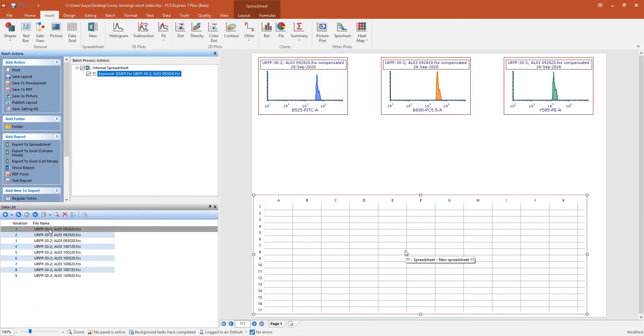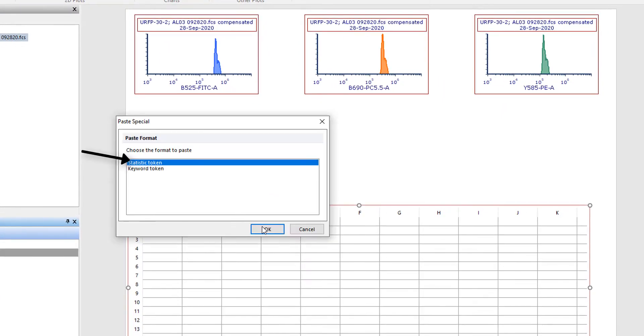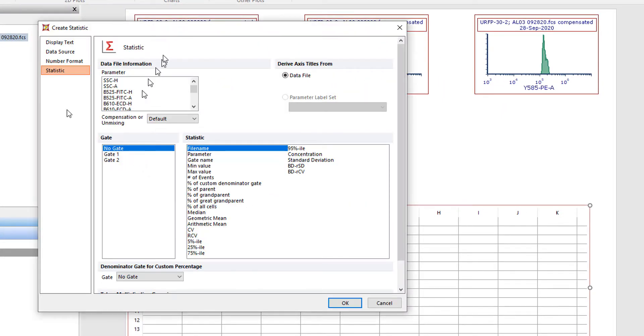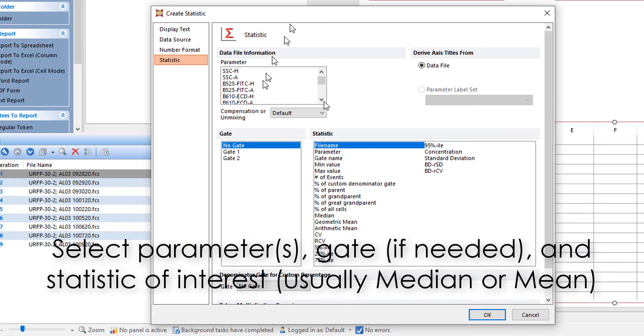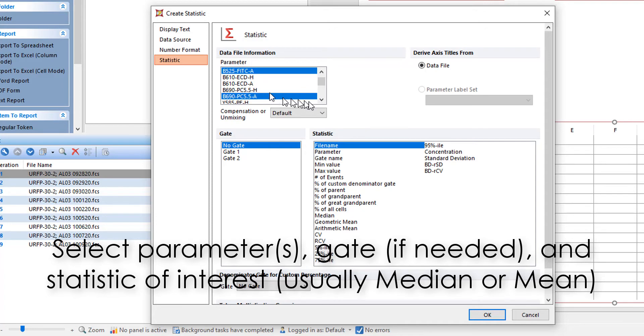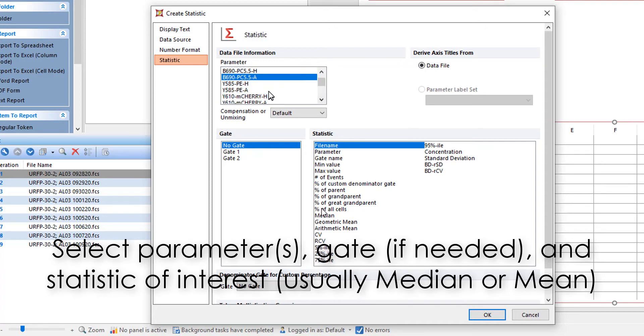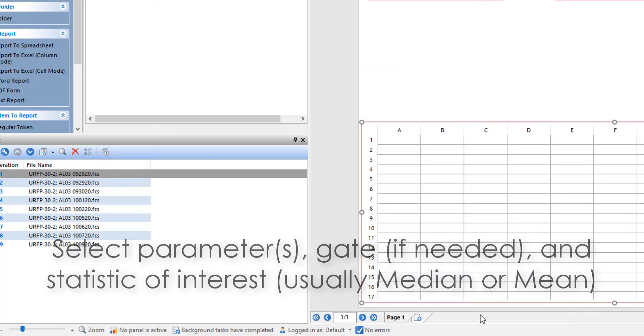Drag the first file again to the Batch Process action, choose Statistic Token, select the Parameters of Interest, the Gate, and the Statistic, Median or Mean, and click OK.